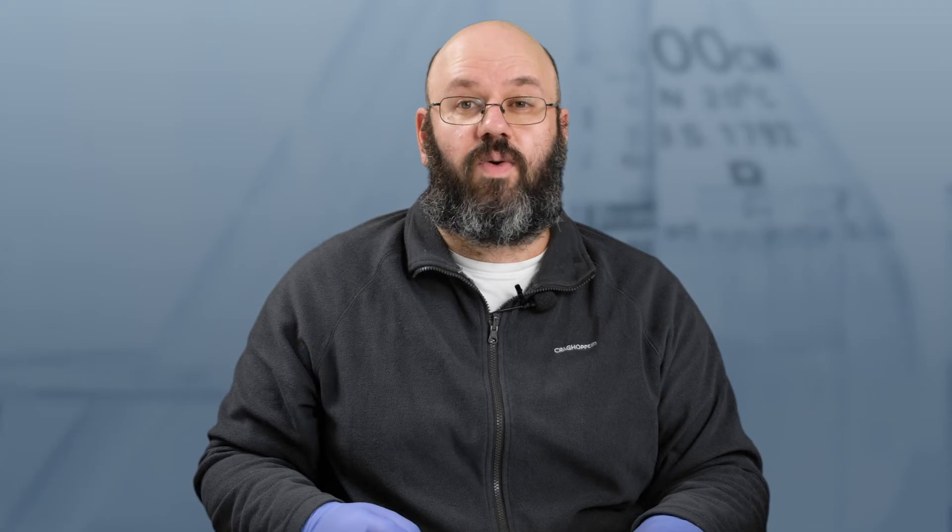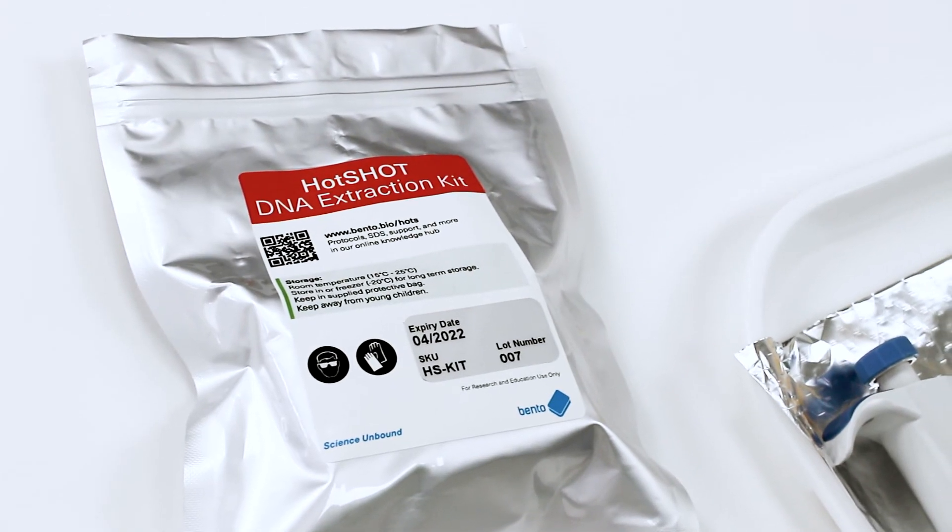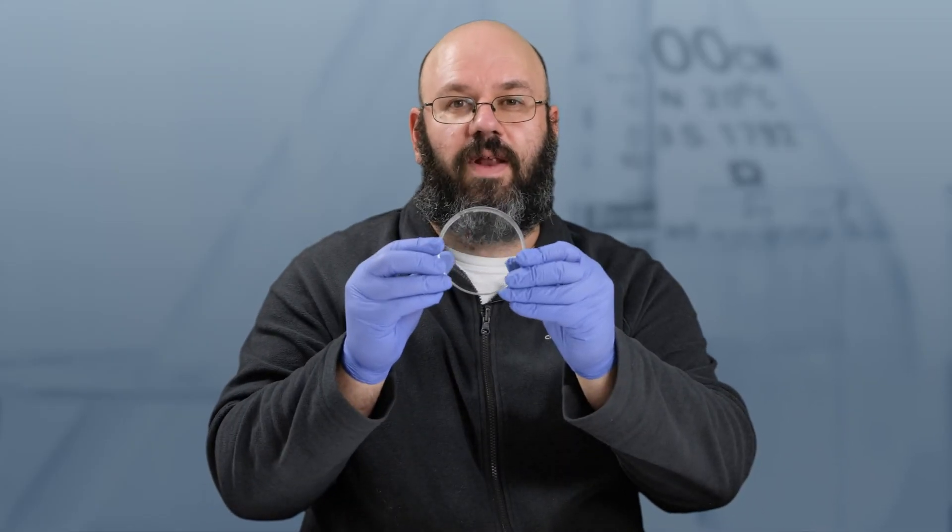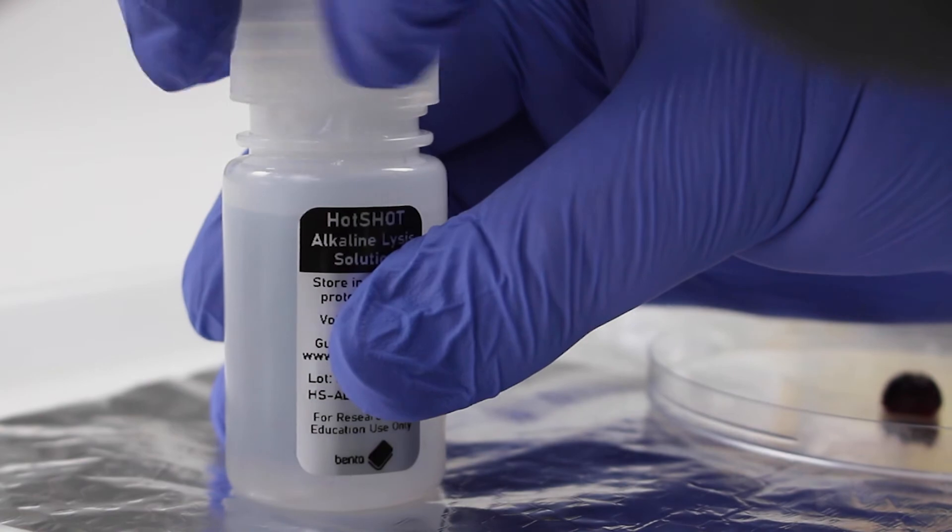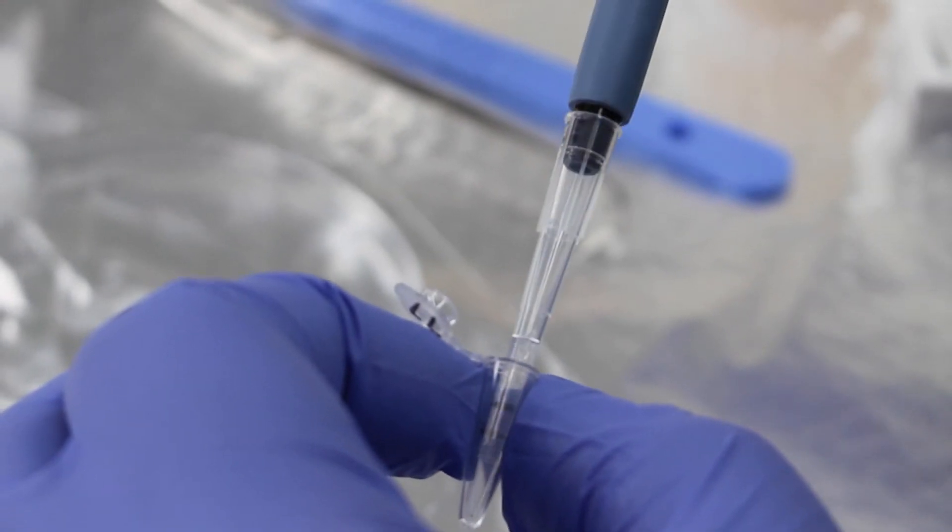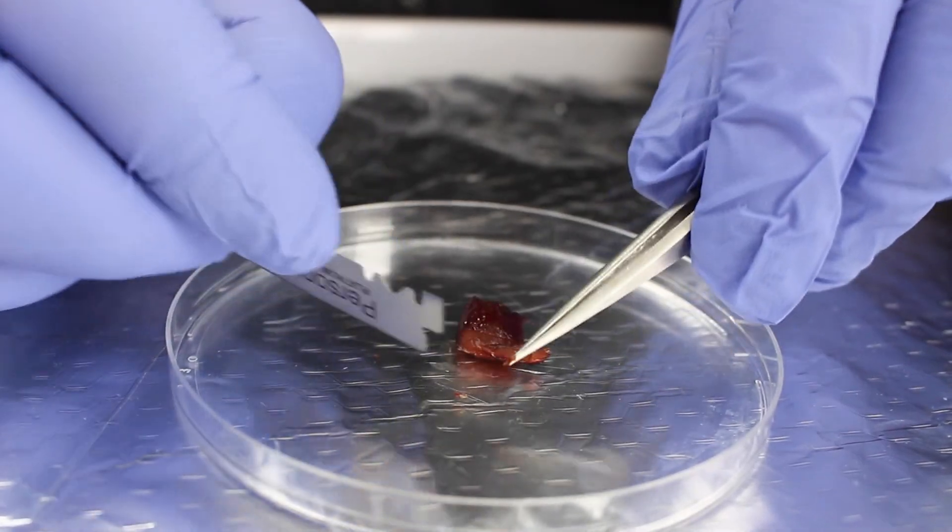Now let me give you a quick demo. I'll be using the Bento Hotshot Kit. I've prepared a very small sample of lamb liver. First, I'll be adding a very small amount of alkaline lysis solution to a PCR tube. Then I will add the sample.